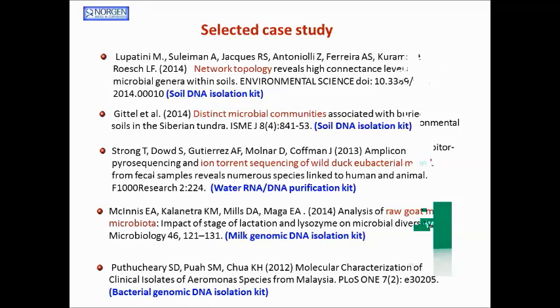But again, the processed byproducts in the fecal samples, as well as the humic acid level, make DNA isolation difficult. Urine naturally contains a high level of urea and salt, and more importantly, the low DNA amount makes it difficult to get enough DNA for sufficient PCR or sequencing analysis.